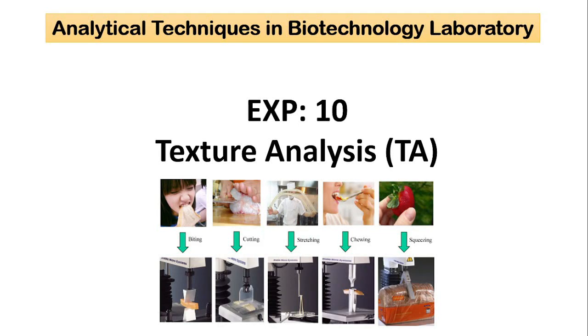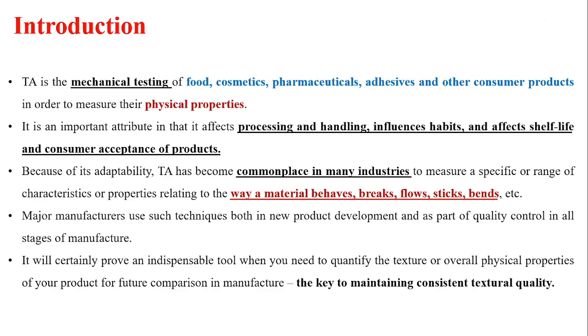Good morning, everyone. Today we will be studying and demonstrating texture analysis. Texture analysis is the mechanical testing of various kinds of products such as food, cosmetics, pharmaceuticals, etc.